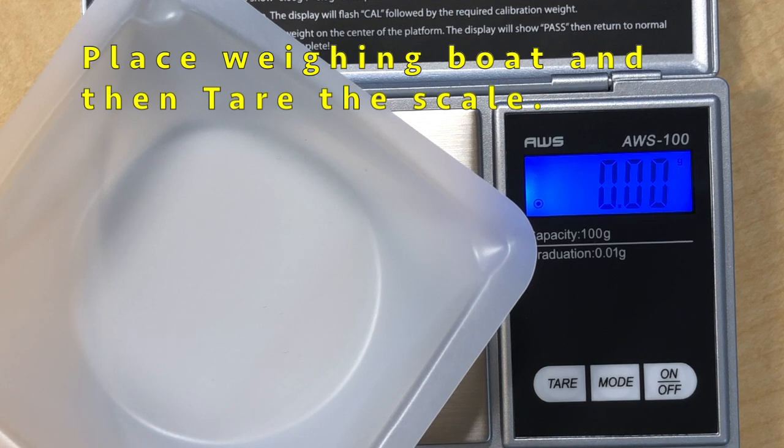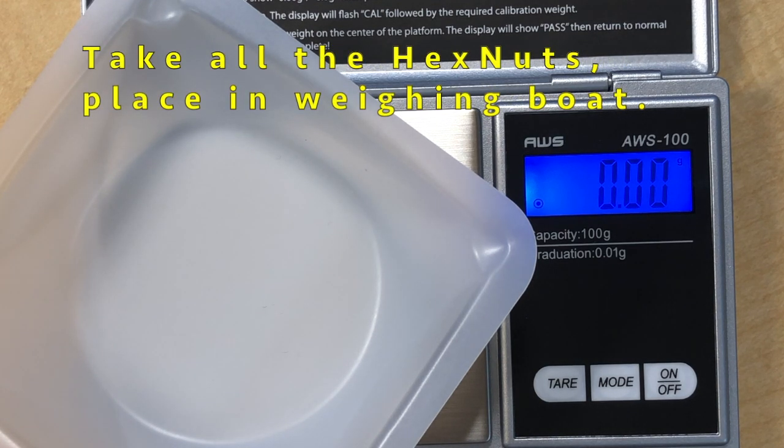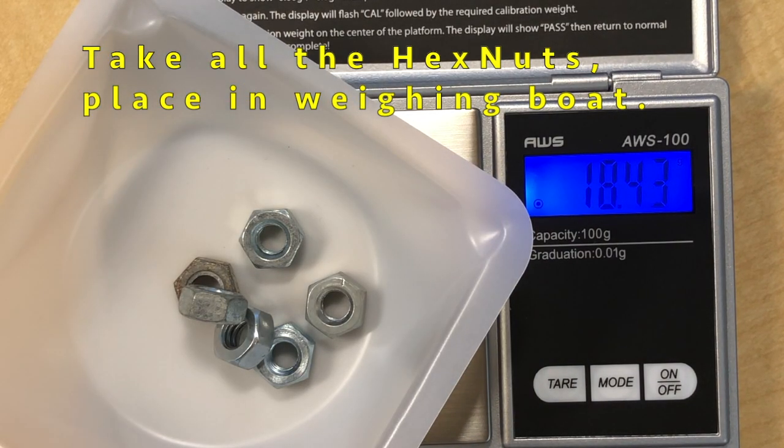Take all the nuts from your packet, place them on the weighing boat, and record the total mass.